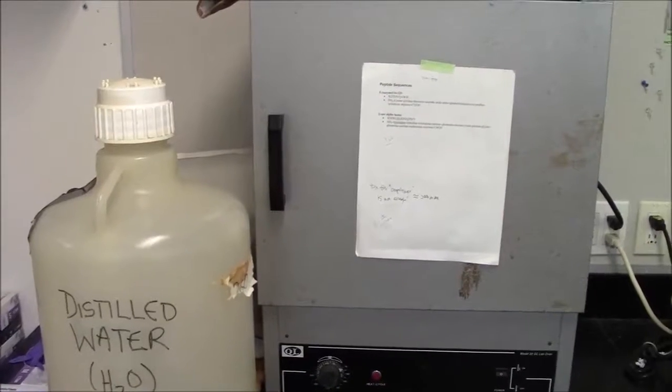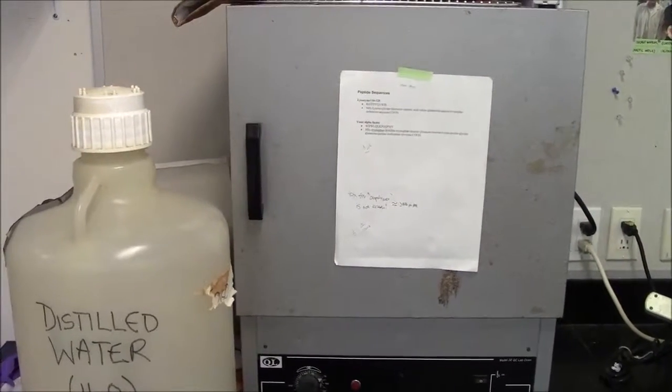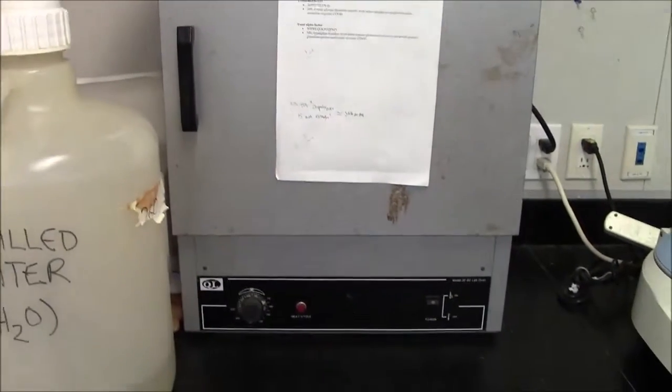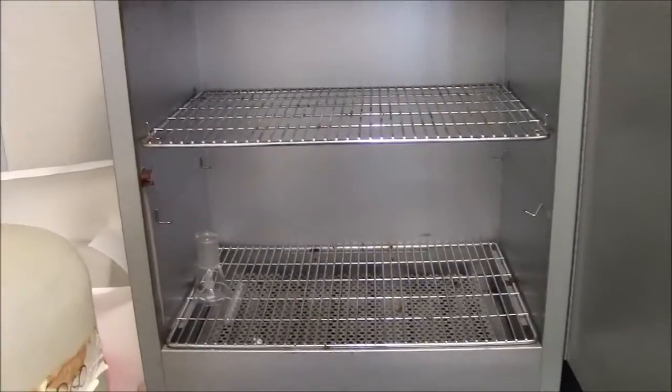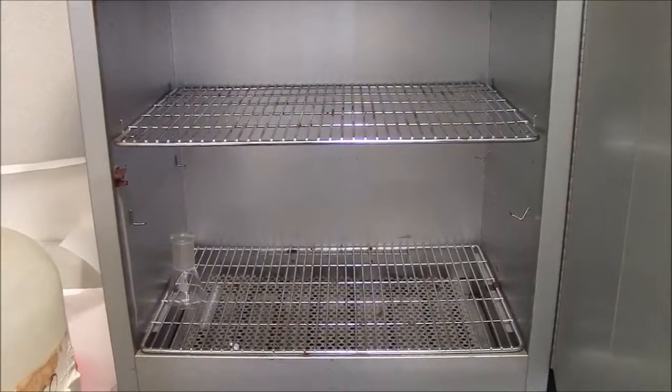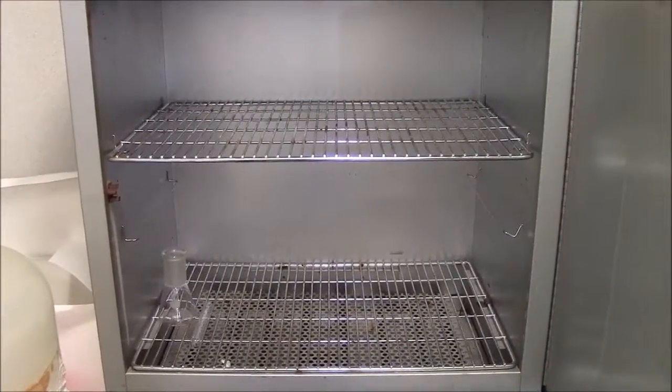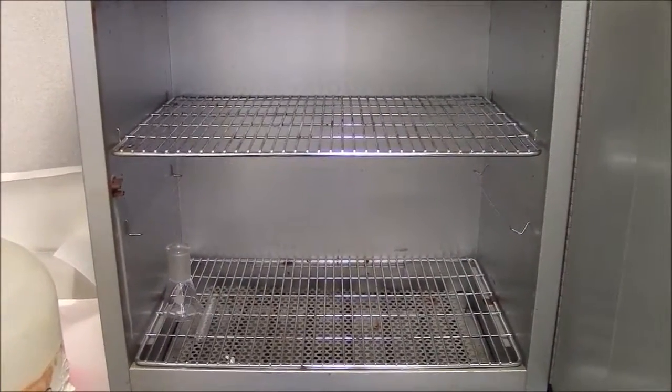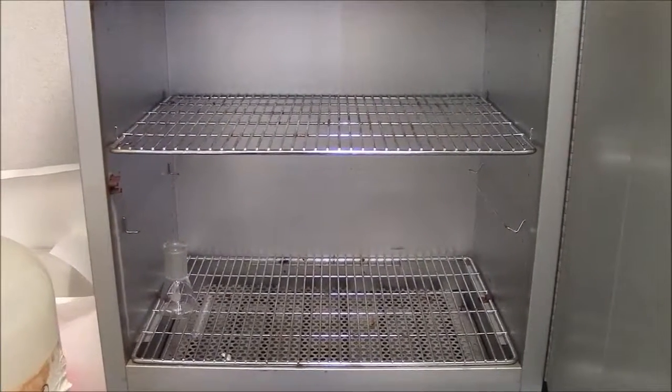Here, near the distilled water jug, we have a drying oven. This can be set to a reasonably high temperature. And you could set something in here that you want to evaporate the water and it would dry in a gentle fashion rather than using your Bunsen burner that might burn things to a crisp.